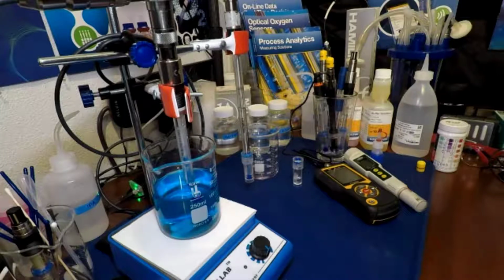There are optical pH sensors. Those are not ready for real time. They experience tremendous drift. There have been some recent cases where those have been used with some amount of success in single use, very small mini bioreactors, where people are doing rough crude testing of 20, 30 different strains at a time, and they just need to get a rough idea of where they're at, plus or minus a half a pH unit. Totally fine if there's some drift.